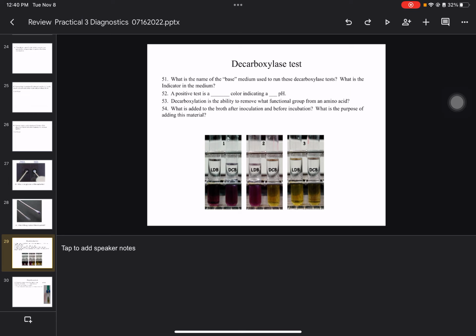Yes. So for the substrate, it's 3 different tubes, 3 possible different substrates. They're all run individually. And what you're going to find out, Isabella, is that you can pick one or the other, because these are confirmation tests for your unknowns. You pick one to confirm that that's what you have.